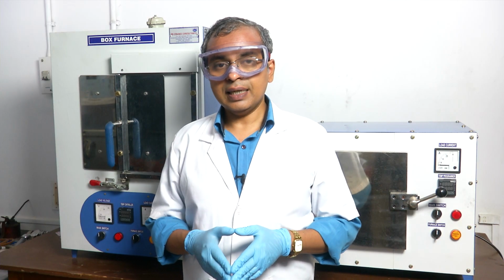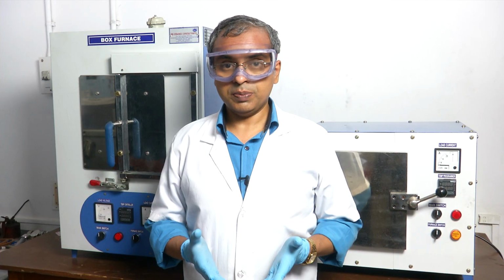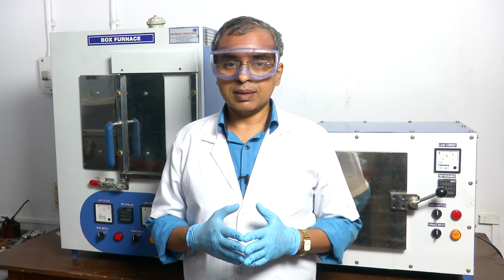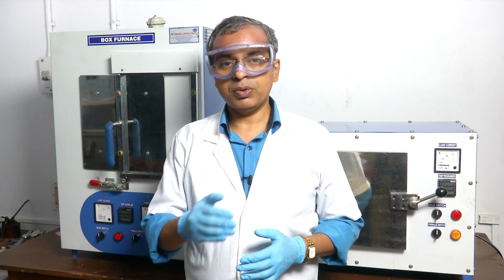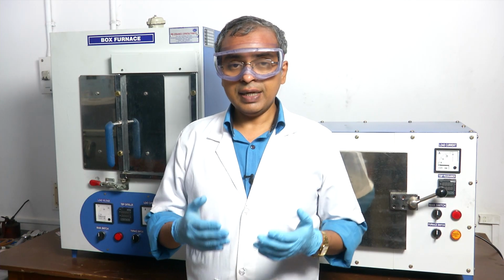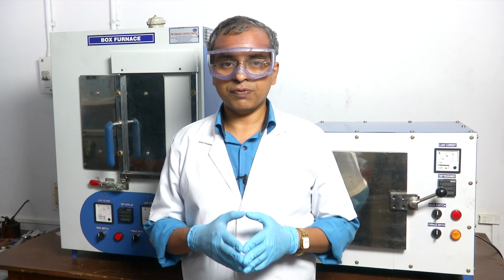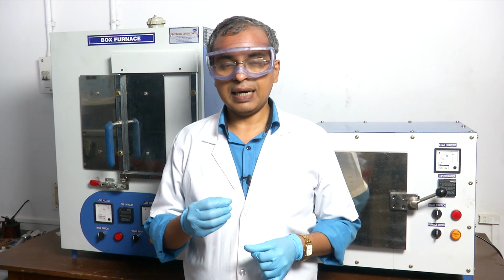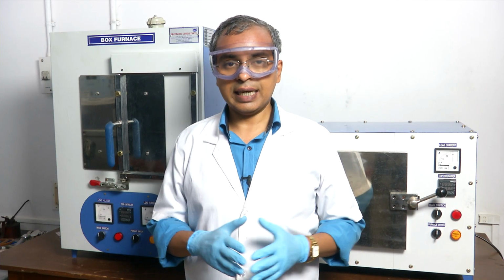In a research lab setting, actually quite the opposite is true. Most of the time we are trying to do new experiments, we are making new experimental setups, and we are trying out some new feature in our experiment and so on, and therefore we are often pushing the boundaries in various different directions. So we have to be even more actively involved in figuring out the aspects of that experiment that require us to be more careful, and where we have to put in more effort and ensure that the experiment is carried out safely.